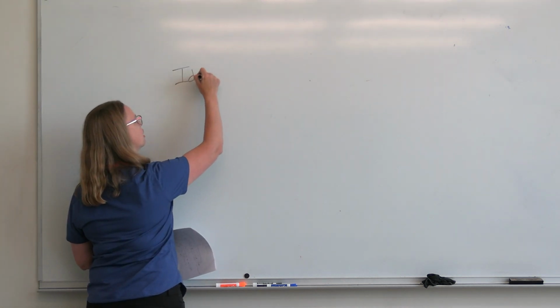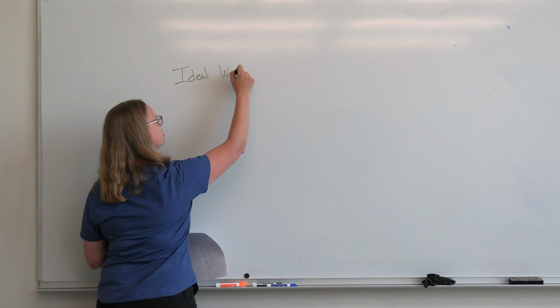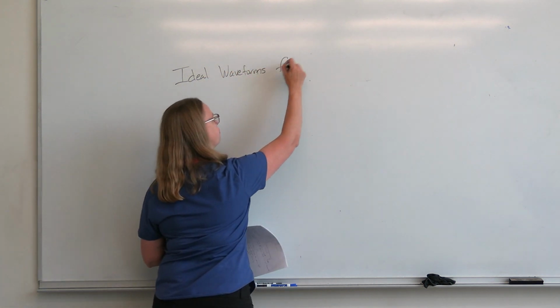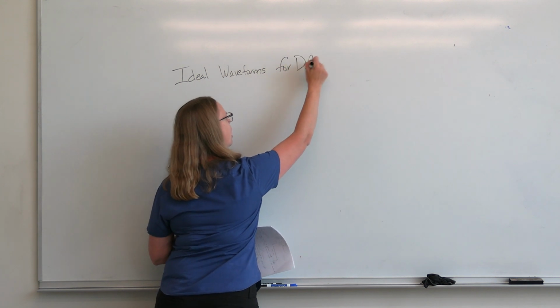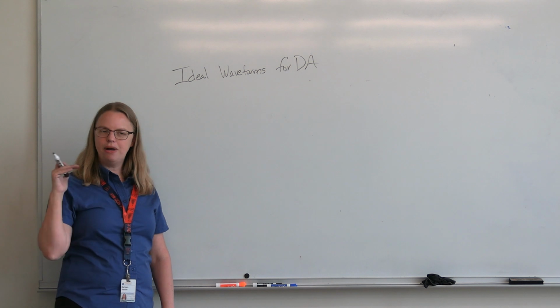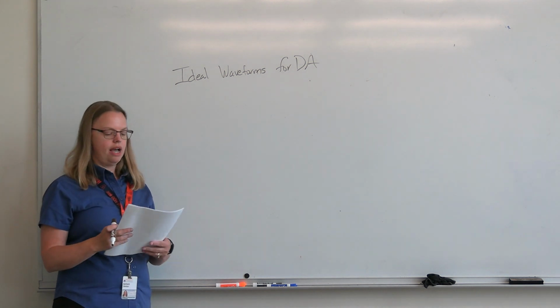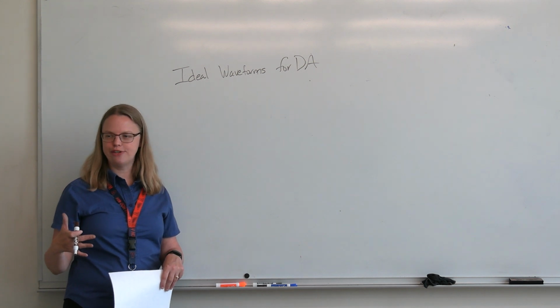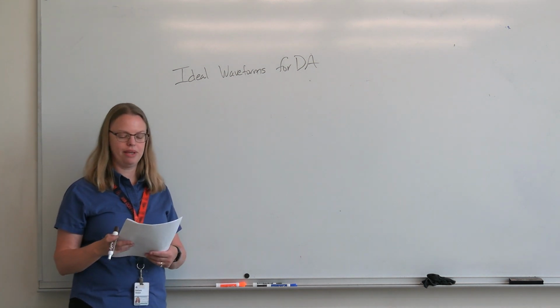Ideal waveforms for dopamine. Again, I'm hoping to do some other analytes as we go on in this series, but today we're just going to look at dopamine. There's a standard kind of waveform now for dopamine, and I'm just going to try and go over how we got there.